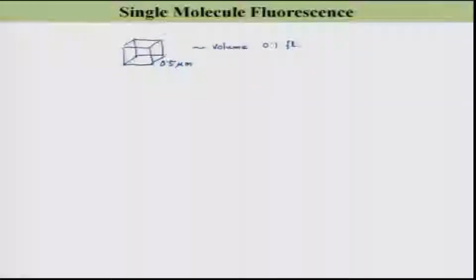So you need a similar dimension to be achieved. Today we are going to discuss how to achieve such a small observation volume.